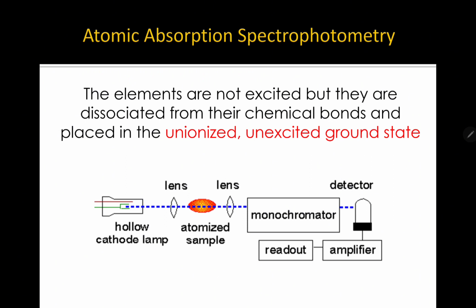So remember that, right, you have your atoms. When your electrons are in their orbital, that is what we call the ground state. Once it leaves its ground state, it will become an excited state. So here, it is just saying that the ground state absorbs light energy of a specific wavelength. So a wavelength is introduced, okay? And then it will enter the excited state.